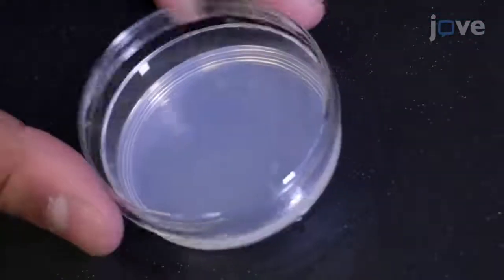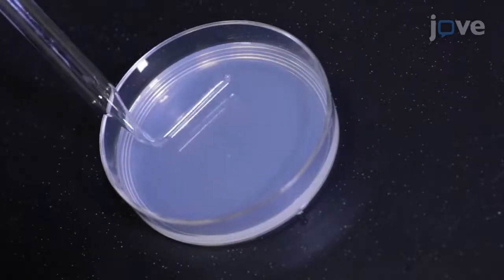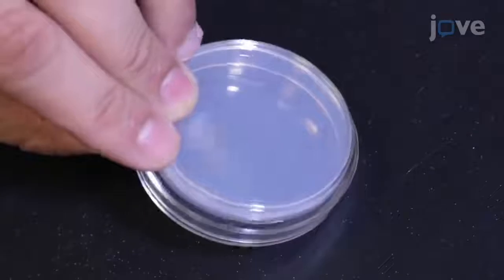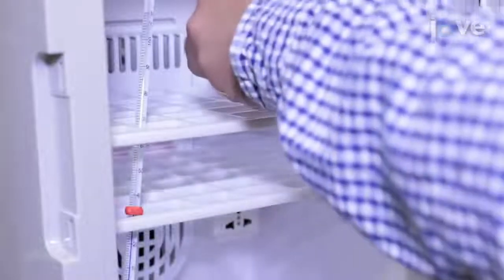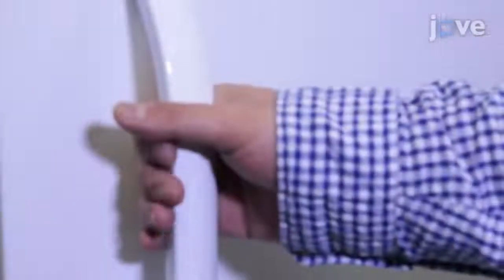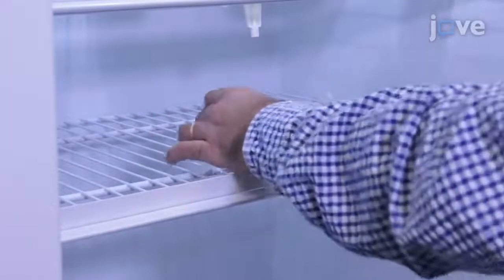Next, use a spreader to spread the inoculum and patch roughly 2 by 2 cm. Approximately after 15 minutes, invert the OP50 plate after the inoculum has dried up. Then incubate the plate at 37 degrees Celsius for 36 hours. Once the incubation is over, transfer the plate to 4 degrees Celsius till use.